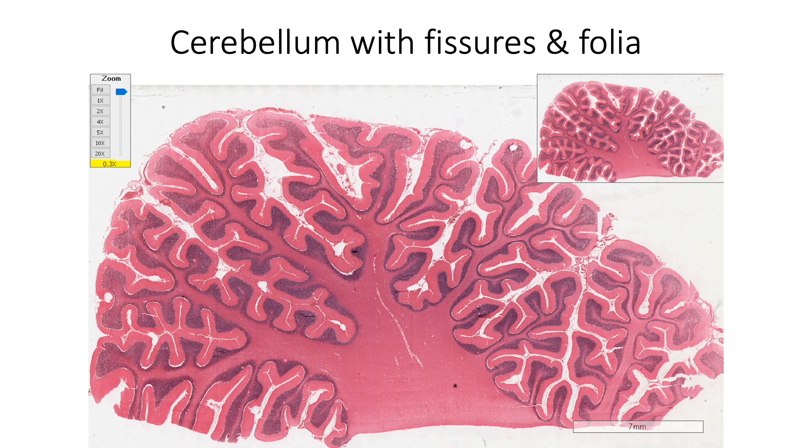Like any other part of central nervous system, cerebellum is also covered by three layers of meninges. In this section of cerebellum under low power magnification, we can see the surface depressions or fissures shown by the arrows separating the folia.